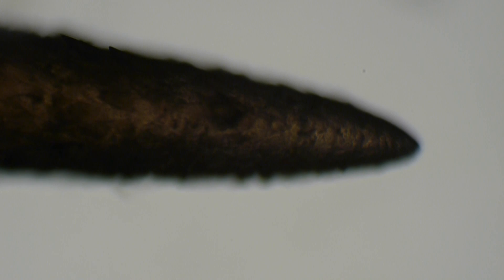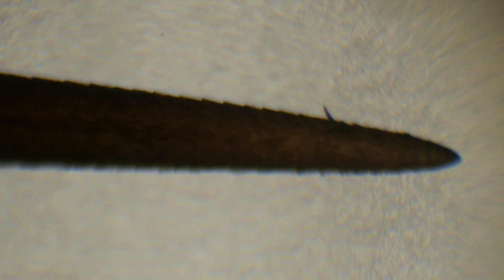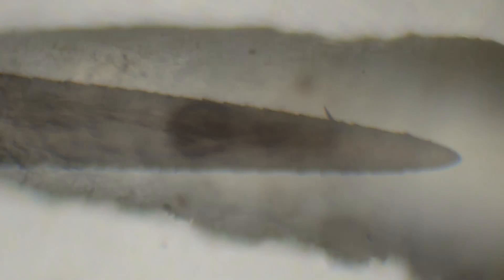This is a compound microscope, and this is actually what you'll usually find in your laboratory. It starts at about 40 times larger than life and goes up to a thousand times larger than life, so it's great for seeing much smaller things. Here you can see the scales as they look through a compound microscope, and over here you get a pretty good view of that root end and how it's tapered.